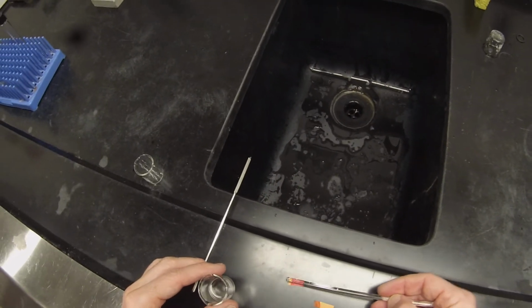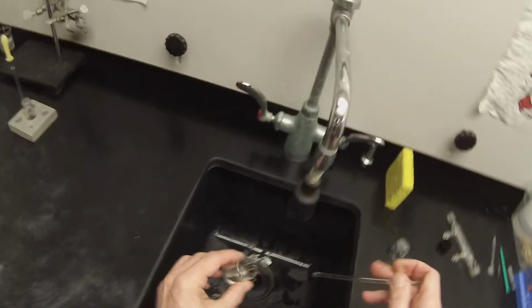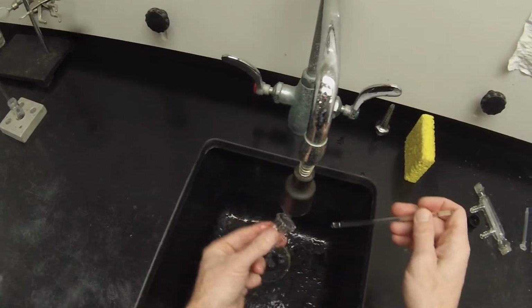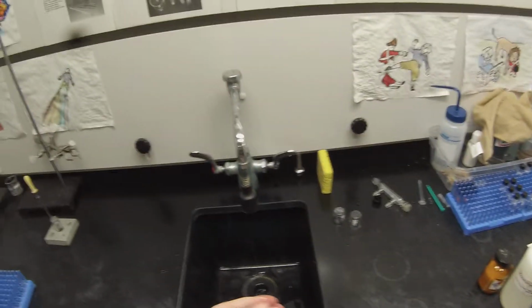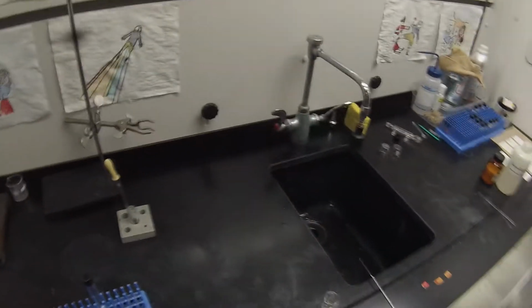Okay, so you can see that it's not quite as bright red. Put those side by side. So we don't need that one anymore. And if I'm lucky, that means that the third wash will not be acidic anymore. We have to make sure the acetic acid's gone or it will interfere with the distillation.